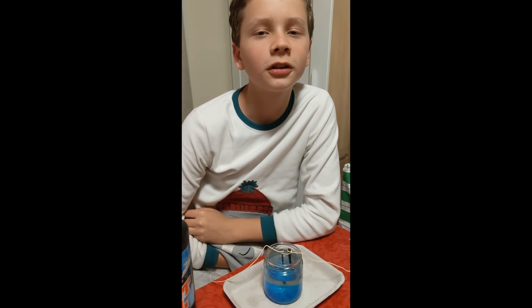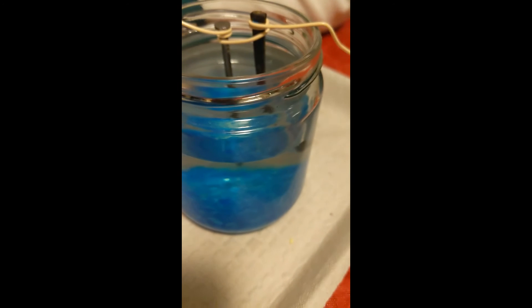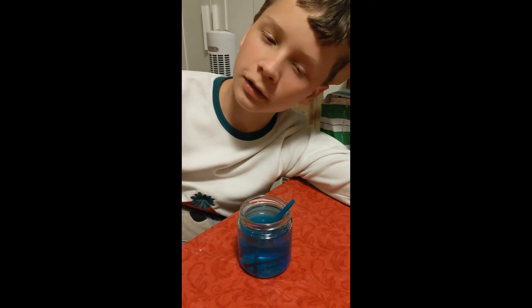I put copper sulfate in the water but haven't mixed it into a solution yet. Now I've mixed the copper sulfate into the water.